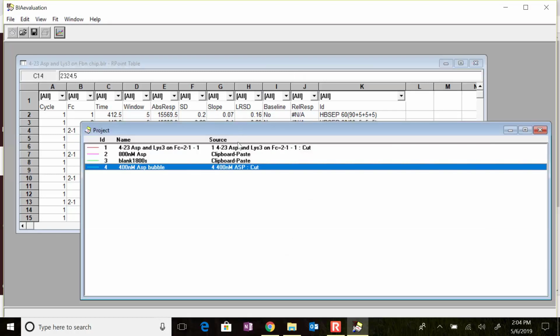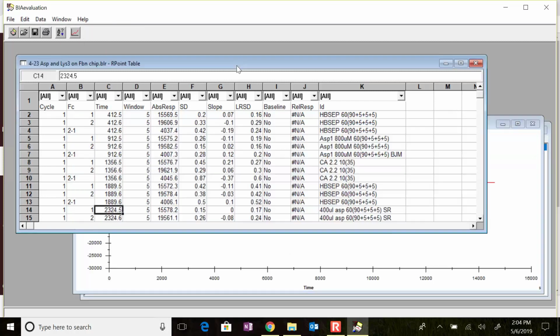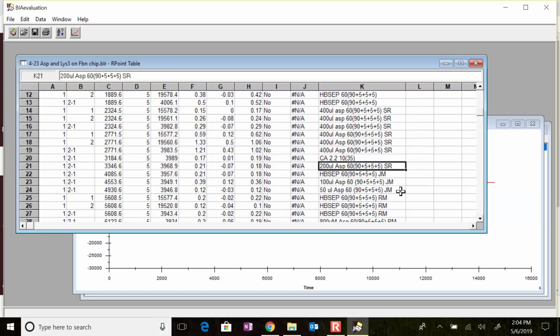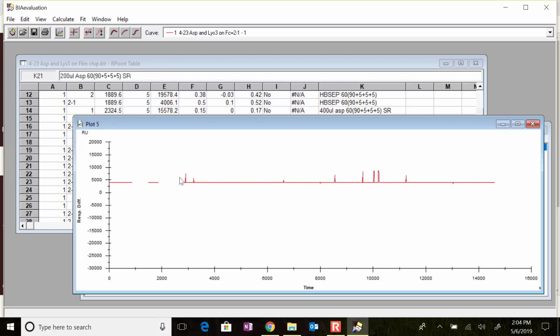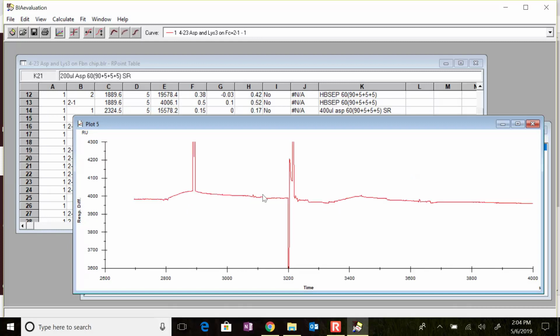All right. So now we've got 2 data sets and 1 blank. Let's see what our next one down is. 400. We go down to 200. And 200 will be at 3350. By the way, it's putting where you put the flag. And this is why I say always put the flag right before the injection starts, because now we can look for 3350, and we can know that looking after that is where it will start.